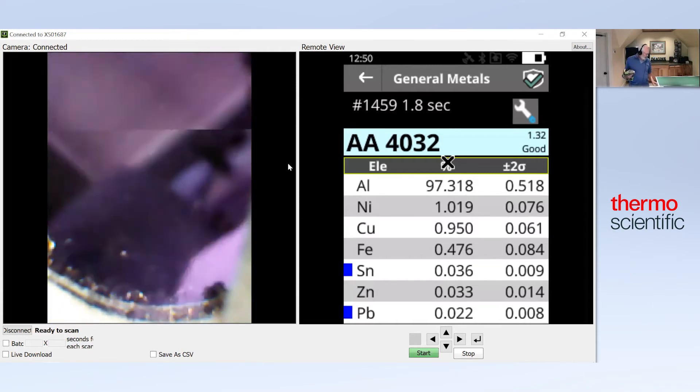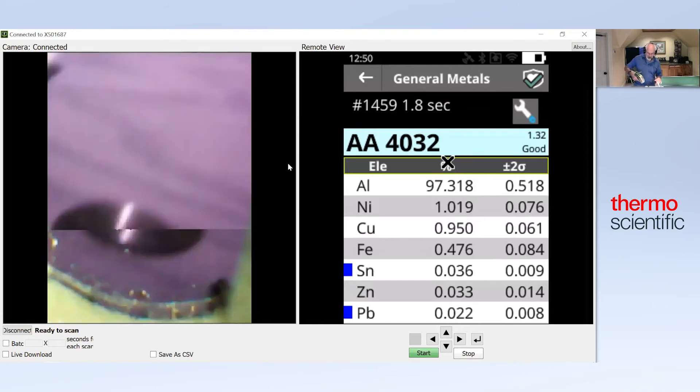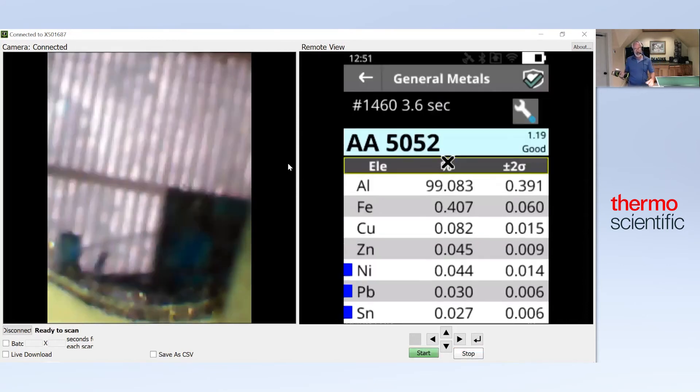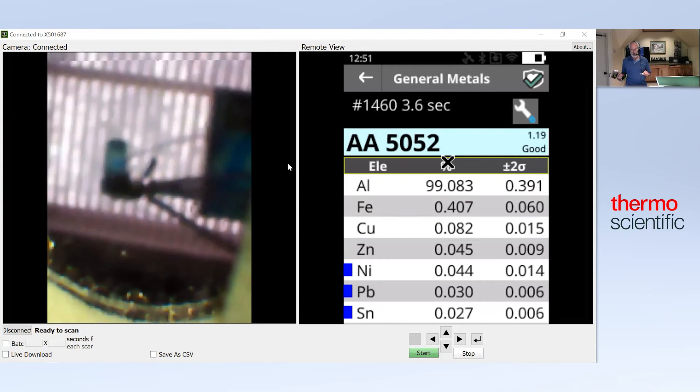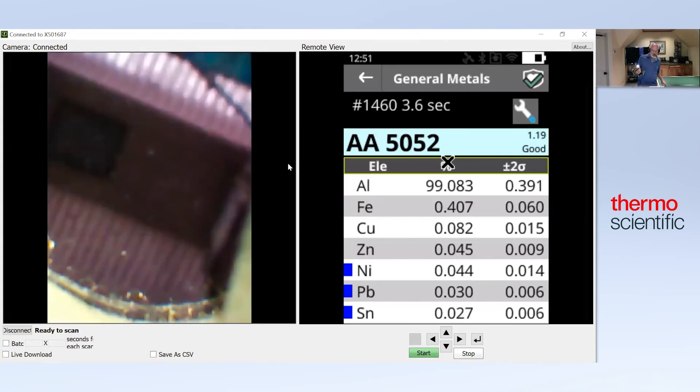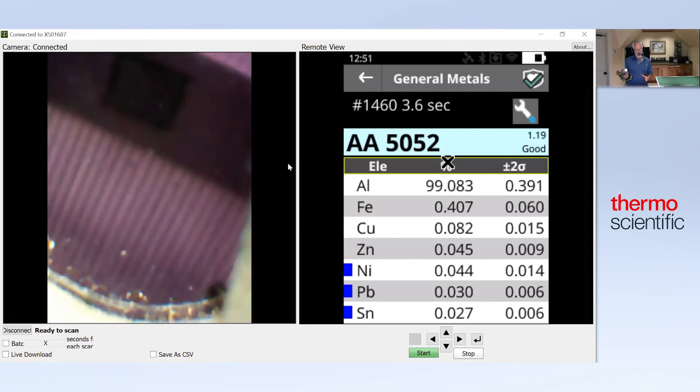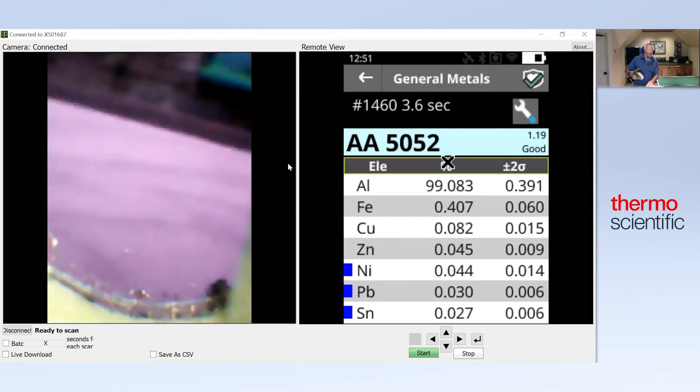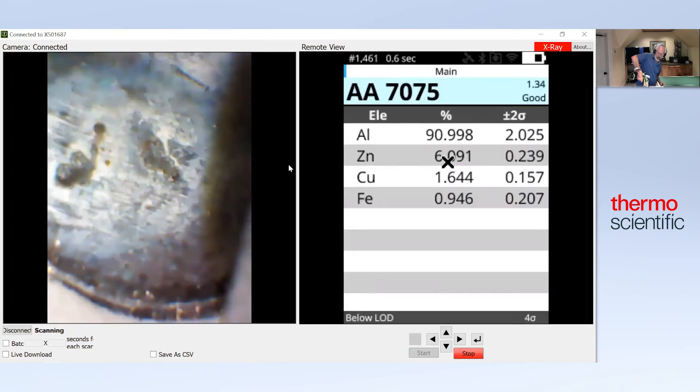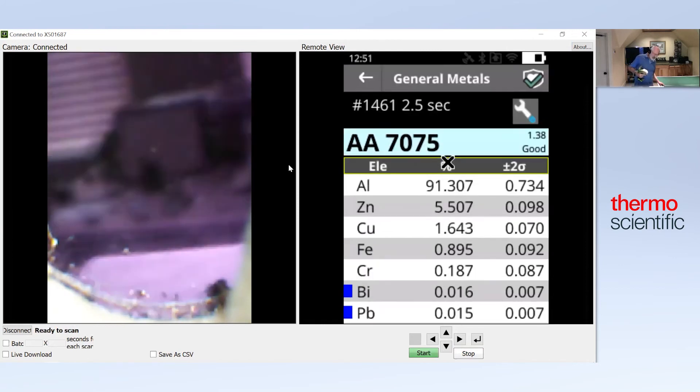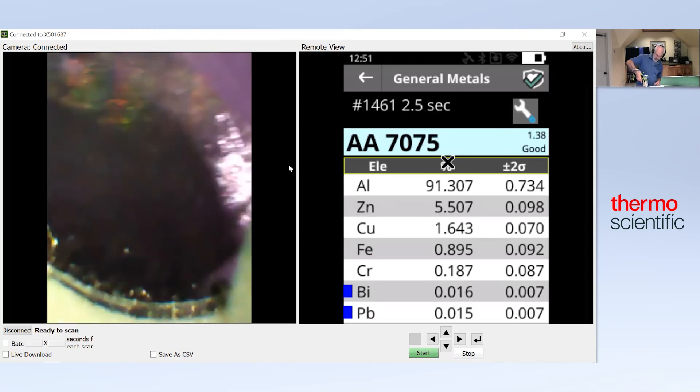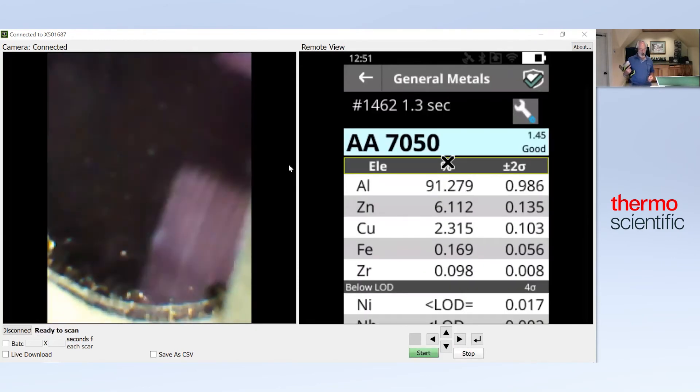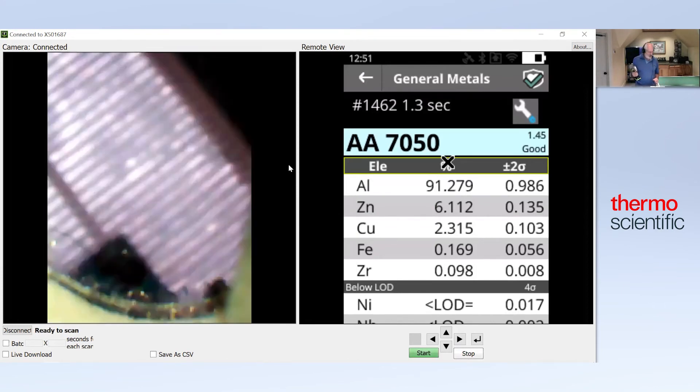If I wanted to hold the trigger longer, it would switch over to the light filter and I would measure the light elements in 4032. Here's a 5052 characterized mainly by magnesium. Now magnesium is a light element, so can I get this without going to that? The answer is yes. Again, it's the fingerprint that does it, the fingerprint of all the other elements. So we don't have to go to the light filter to know that's a 5052. Now if I had a 5056, which is very similar with the exception of magnesium, I would have to hold the trigger another few seconds to get the difference in magnesium and sort those two. Here's a 7075, your high zinc and copper both other aircraft alloy and one very similar, so close that the only difference is a tenth of a percent in zirconium. And you'll see it picks that zirconium up right away. We're pretty satisfied that we can do all the aluminums quite quickly.